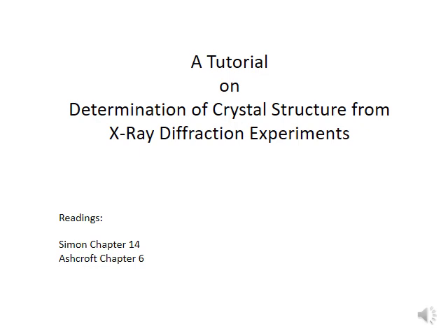But there's another utility of scattering experiments, and that is they are used to determine the crystal structure of an unknown material. And in this shorter module, we would have a look at how X-ray diffraction experiments and the data from X-ray diffraction experiments can be used to determine an unknown crystal structure just by looking at the data.